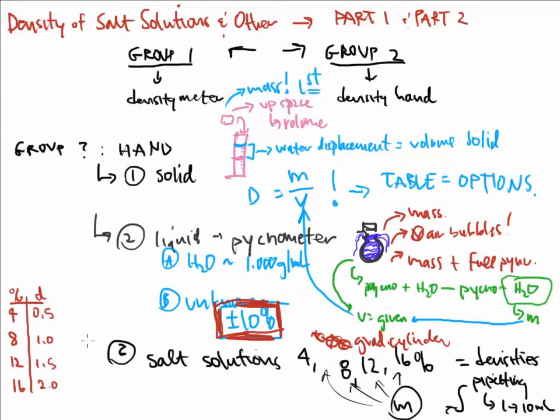I now need to realize what I do with these numbers. You know, what do you want me to do with these numbers? I don't understand. Why do I do these 4, 8s, 12, and 16s? And the reason is because what we're trying to do here is set you up with what we call a calibration curve. This is the first time that you have experienced the calibration curve in the program. And we want you to do this using Excel.